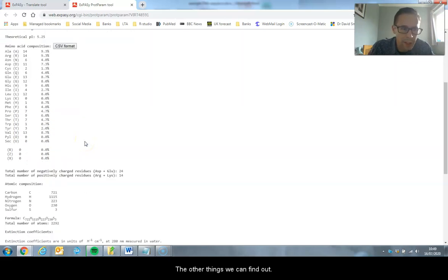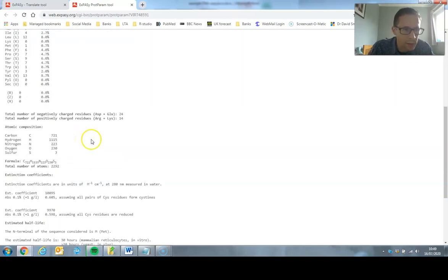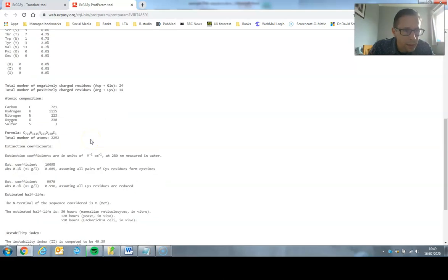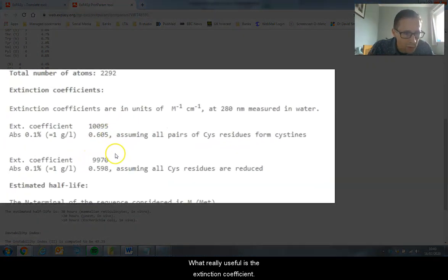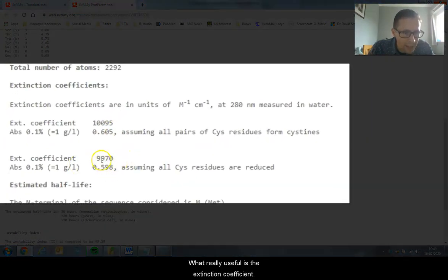The other things we can find out - we can have the formula, but what's really useful is the extinction coefficient.